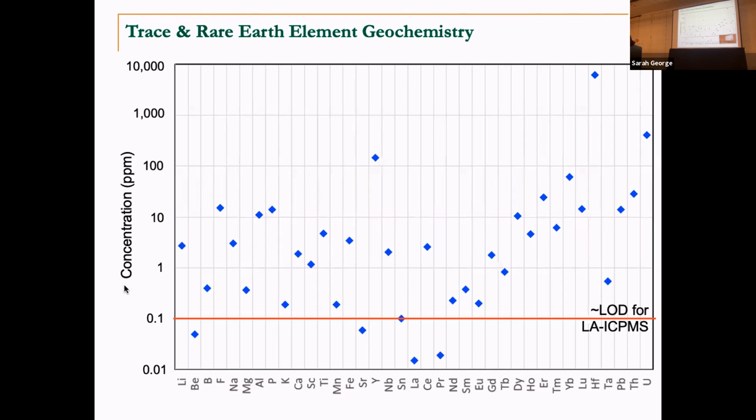So we're not really worried about limits of detection. But now we're dealing with, what do we call them, trace elements. And guess what? They exist in trace abundances. And so this becomes a lot more important, right? So things like lanthanum, maybe we can resolve it, maybe we can't. It depends on the day. Praseodymium, same thing. And so going to labs, you need to know what each lab that you go to can actually resolve on these things. So we think that in our lab, we do well resolving lanthanum, not so well doing praseodymium.